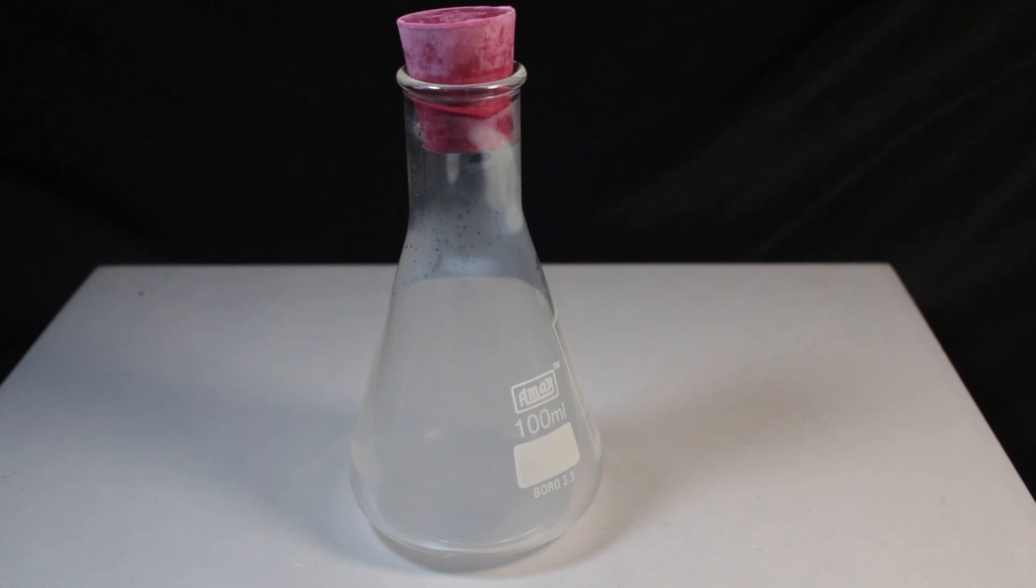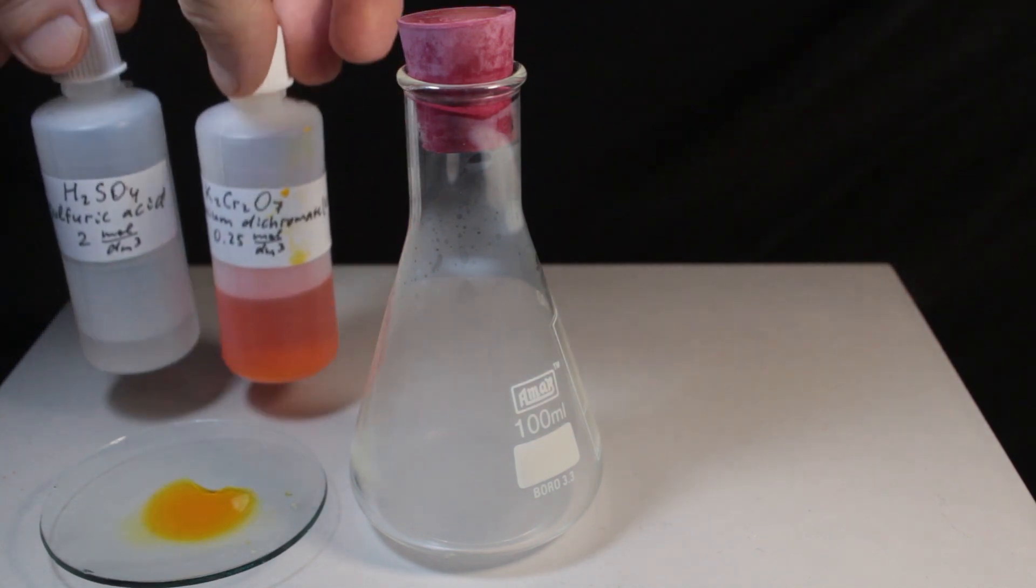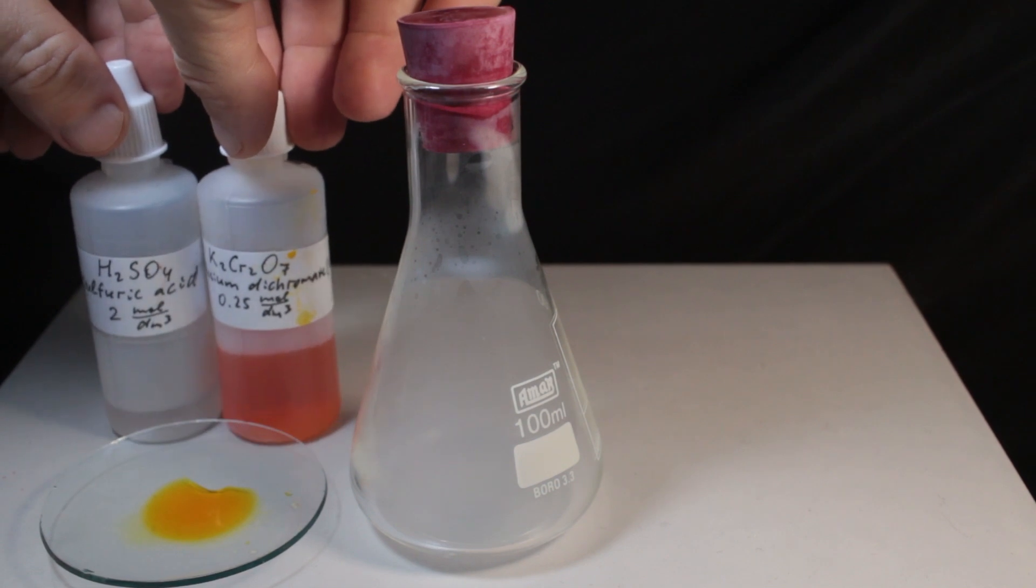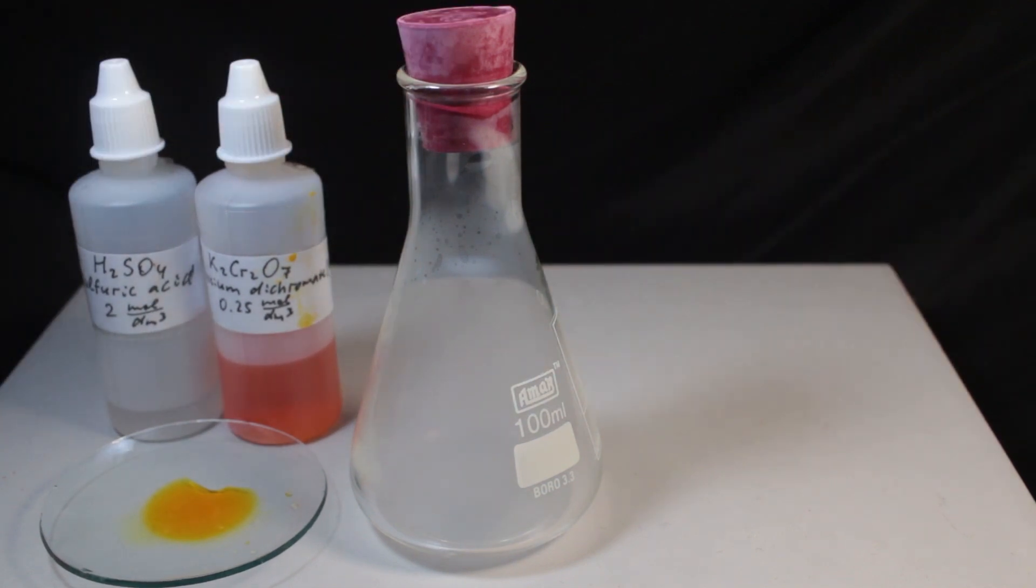Now for other properties, first reducing one. For that we need oxidizing agent, which changed color on reduction. This is acidified potassium dichromate. It's prepared by mixing these two liquids. Potassium dichromate solution and sulfuric acid.